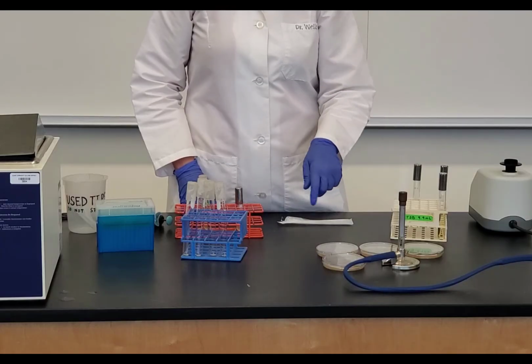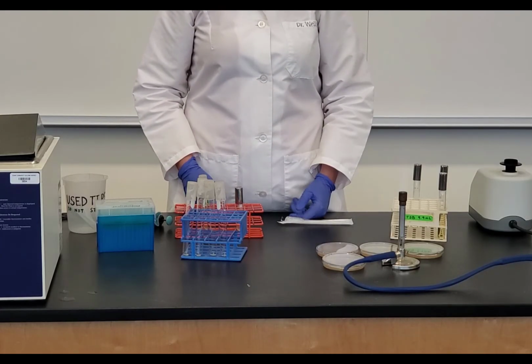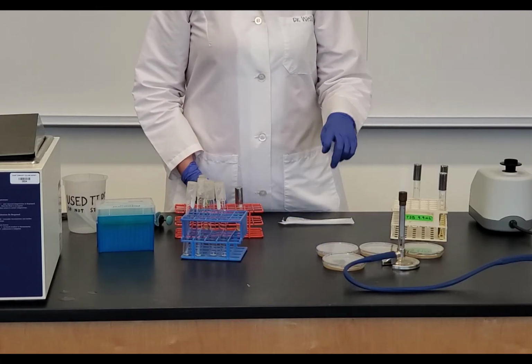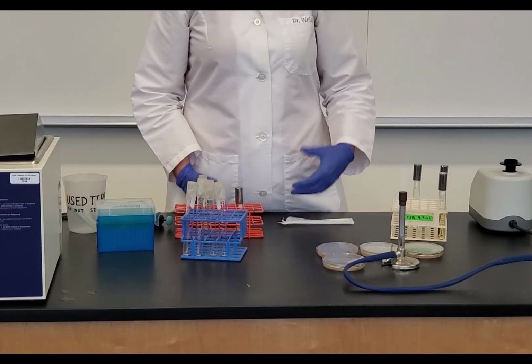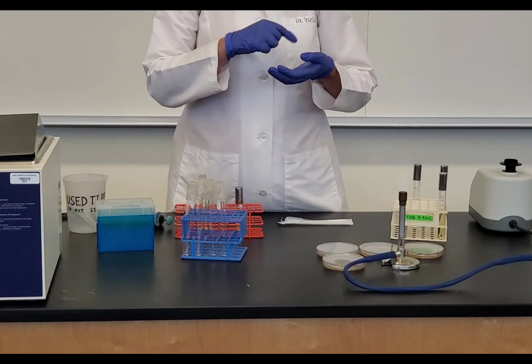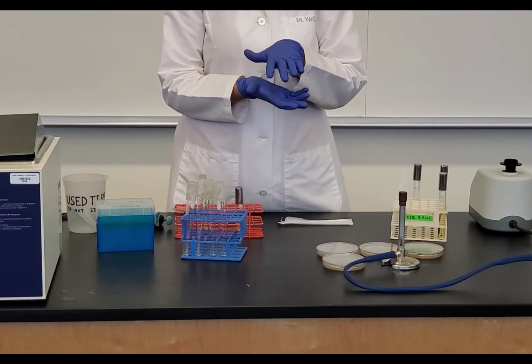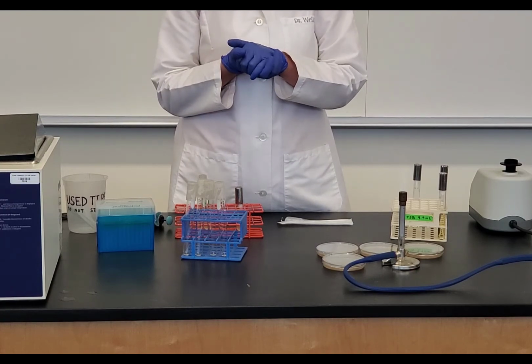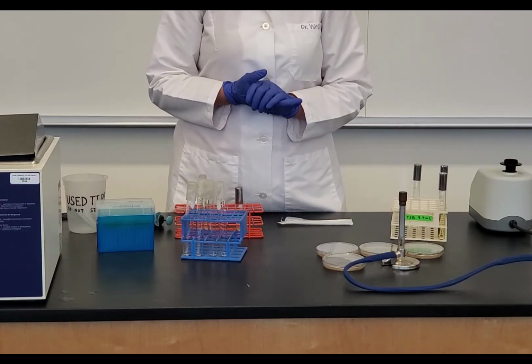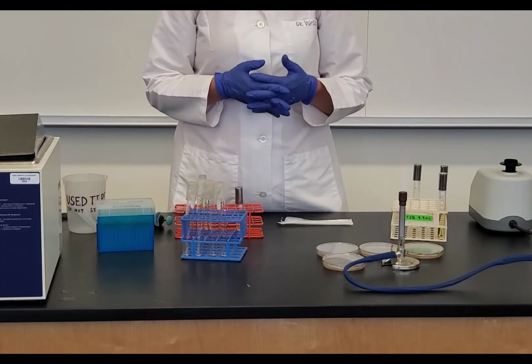So I need to leave these plates to solidify. It takes about 20 minutes or so. I want to make sure that the agar is completely solidified before I pick up those plates. So once I let those sit for 20 minutes, after they've solidified, I'm going to take all 4 plates and put them in a stack. I'm going to rubber band them together, and then I'm going to flip them agar side up and put them in a 37-degree incubator. And so I'm going to incubate those and then use those plates to determine my titer. And so this is how we do the setup for the plaque assay.